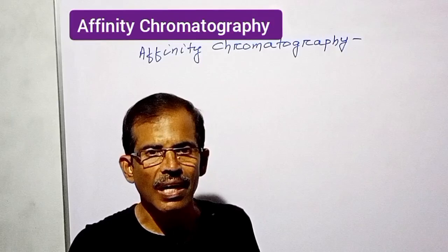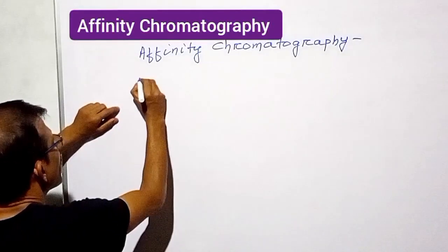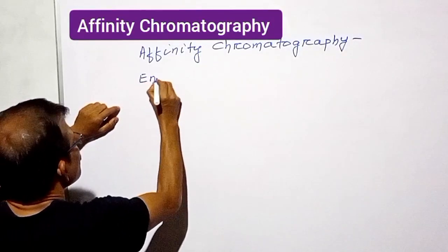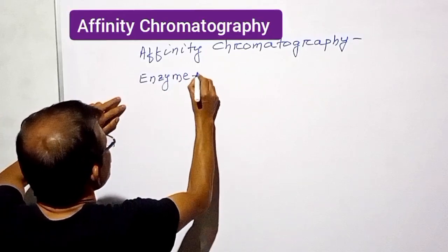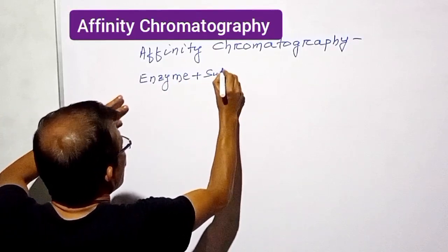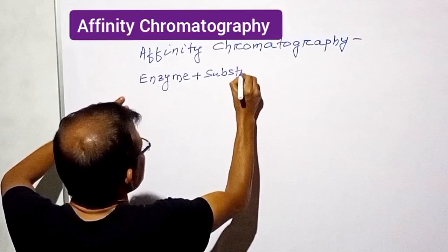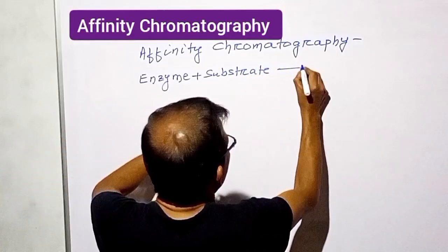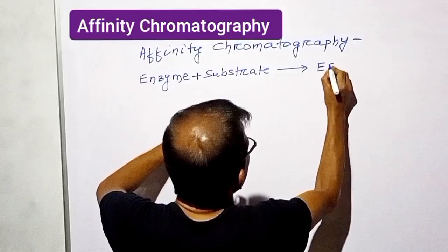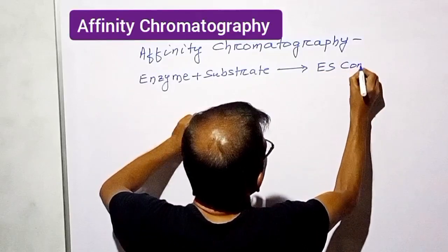All of us are aware that an enzyme binds with a specific substrate or a group of substrates to form the enzyme substrate complex.